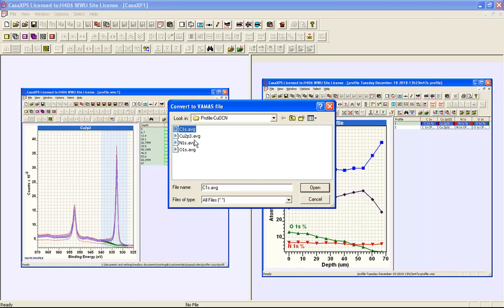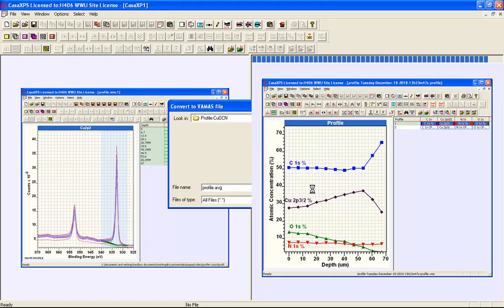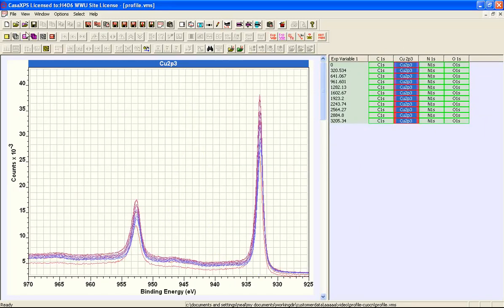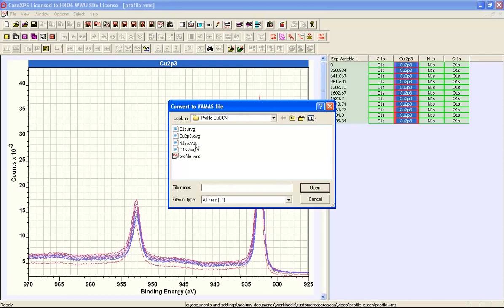When we have a number of these AVG files in a directory, these are converted by CASA XPS and you can specify a file name of your choice with the .avg extension, which instructs CASA XPS to read the AVG files within the directory. These are all from the same depth profile, and when you press the open button a new file is created and the depth profile appears in CASA XPS. The original AVG files are all read and entered into this new file called profile.vms, written back into the directory that contained the AVG files.